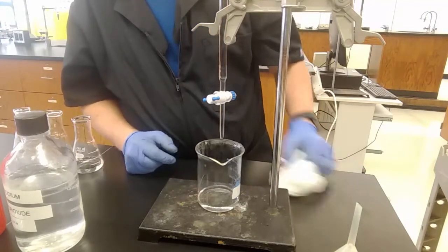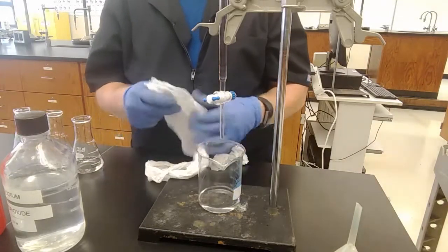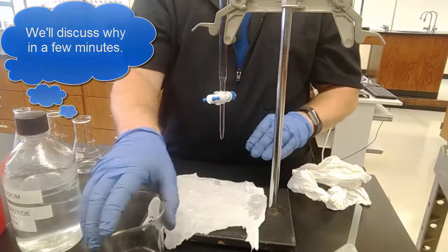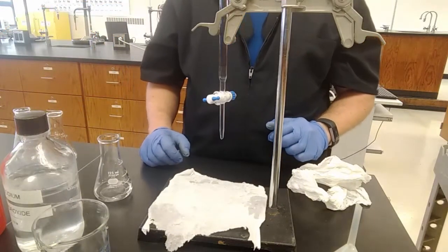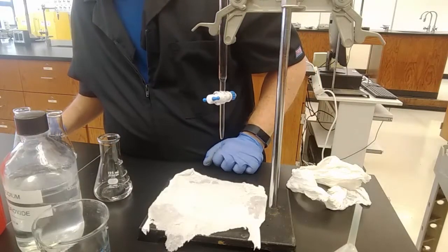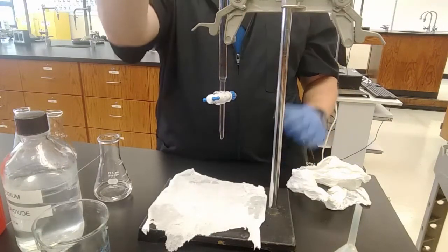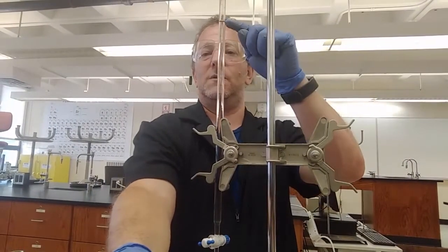So I'm going to put a white piece of paper underneath the flask when I go to start my reaction. Just got a paper towel here. Okay, waste beaker is there. Now, I need to get a good starting reading of my volume. So I need to look really carefully, maybe get a piece of paper with a line on it behind my burette, get my eye level right at the liquid, which is right here.